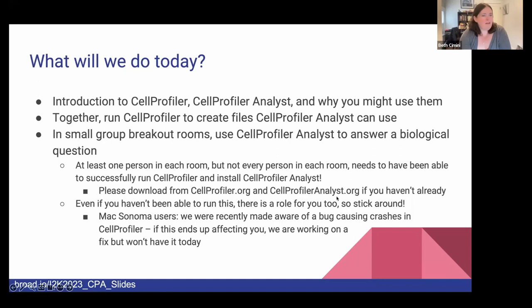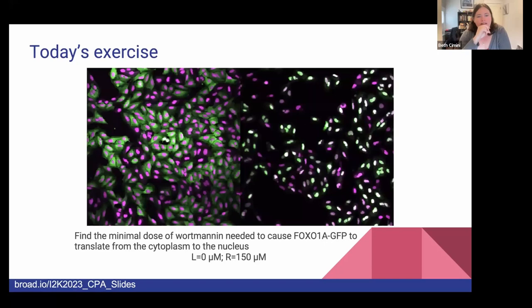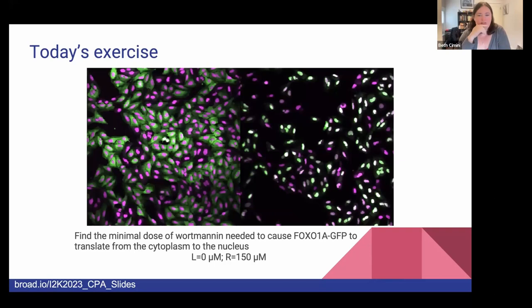The biological question we are going to be trying to solve today is a translocation question. This is real data from a real experiment where wortmannin is being used to cause translocation of a transcription factor called FOXO1A, which has been GFP tagged, to try and figure out what dose causes translocation into the nucleus. On the left you have the negative control with no wortmannin and no translocation; on the right a really high dose, and we'll be calculating the IC50 and looking at a dose response curve.